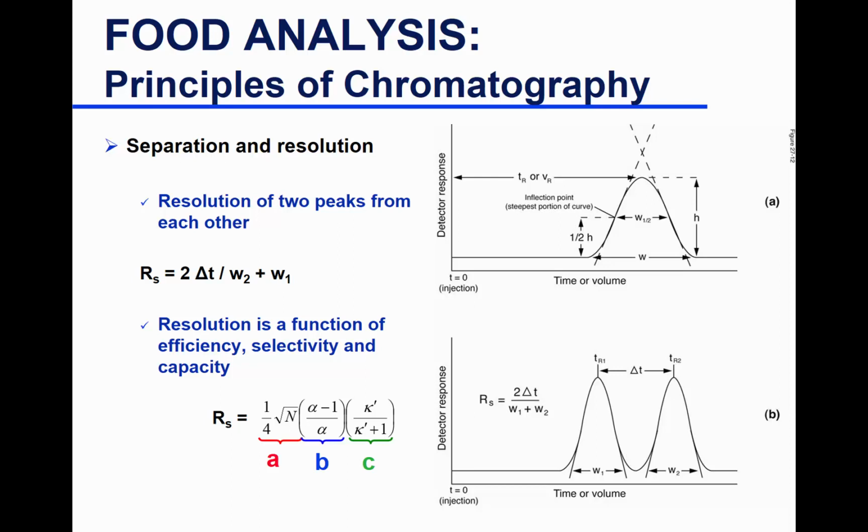Oh, yes. So what exactly do the peaks signify? Is that like the volume emitting from the column?